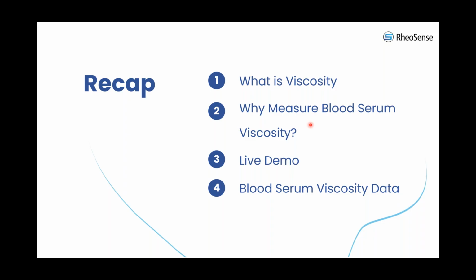I don't want to keep you too long. So we informed what viscosity was. We then informed why it's important to measure the viscosity of blood serum. We showed how we can measure the viscosity of serum with the microVISC Pro. We also showed some experimental results that we obtained with the blood serum. And last, but definitely not least, we gave that demo with the microVISC Pro, from which you saw we quickly got useful and accurate data. Useful with the blood serum, accurate, very repeatable, from this well-calibrated chip.